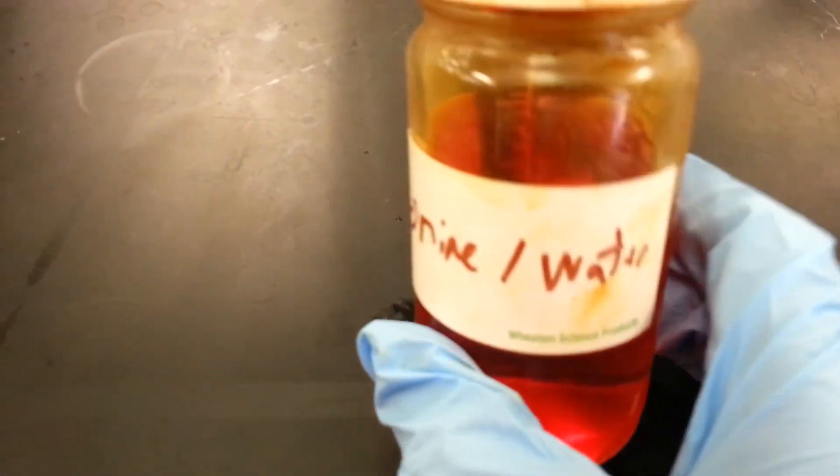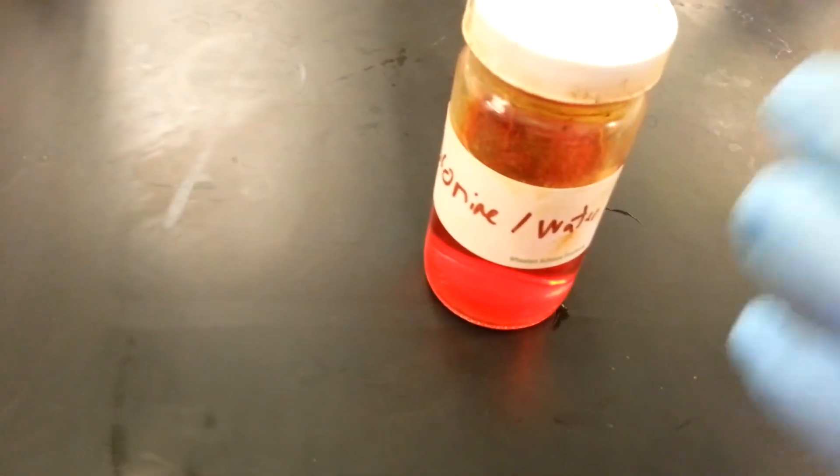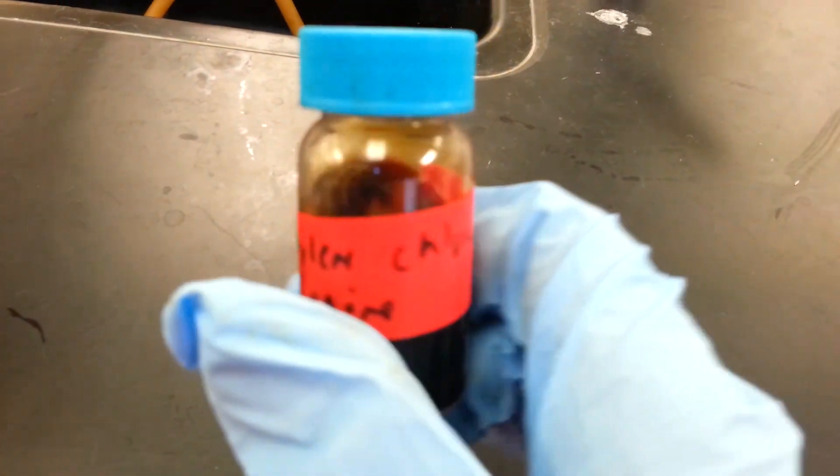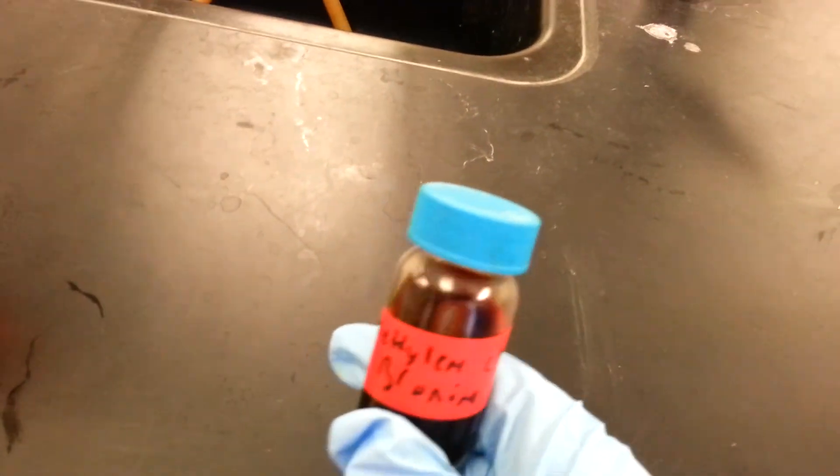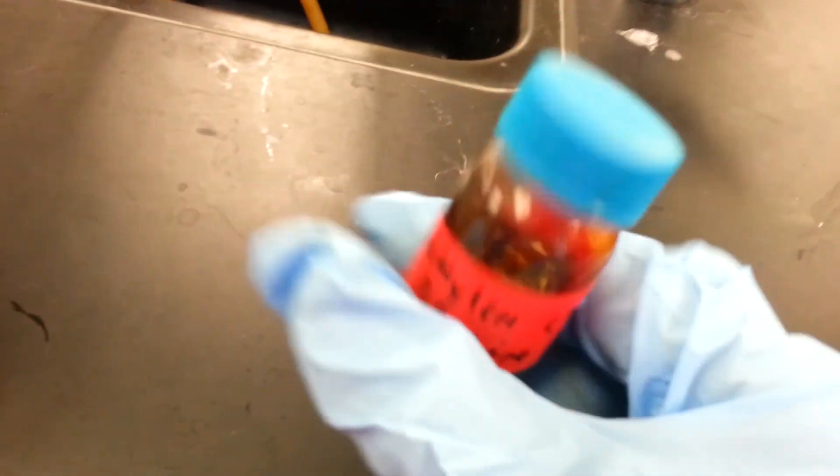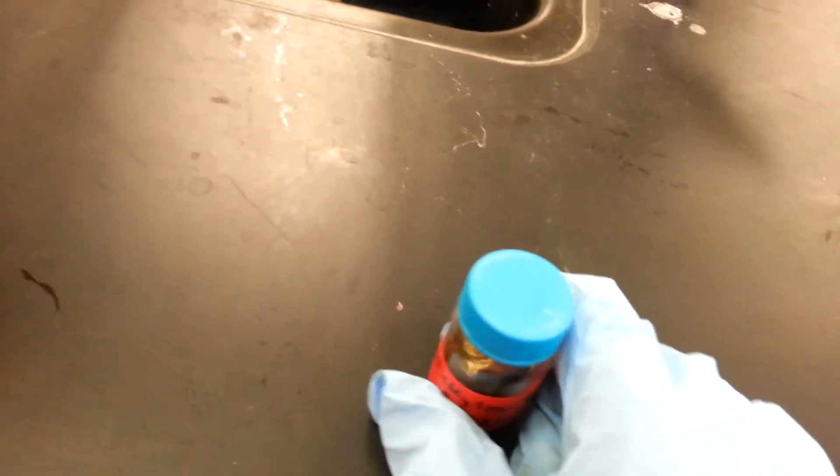An additional test is the bromine and water. As you can pretty much figure out, you just add bromine and water. You got to do it in the fume hood, obviously, because the bromine is not something you want to breathe in. Of course, sometimes the methylene chloride and bromine works a little bit better. But again, fume hood. Always leave these things, you should leave in a fume hood.